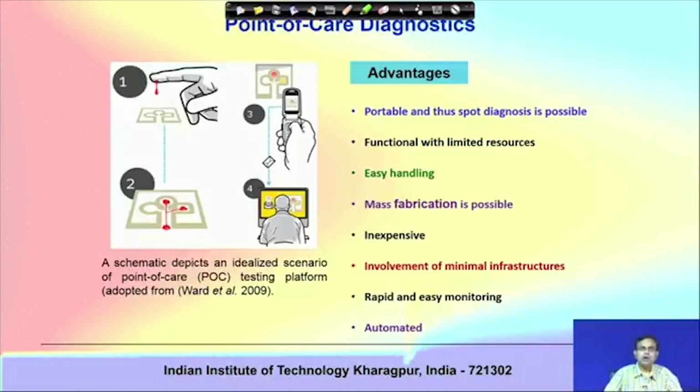So, the complementary antibody or antigen corresponding to the particular disease being interrogated may be embedded on the wall of a small handheld device, and that wall may itself be the wall of a microfluidic channel, because the blood sample can be transported along different microfluidic channels to different reaction sites where different tests will be done. So, in step 2 in the diagram you will see that, for example, there are 3 different test sites. The blood sample can go to 3 different test sites and 3 different tests will be done.